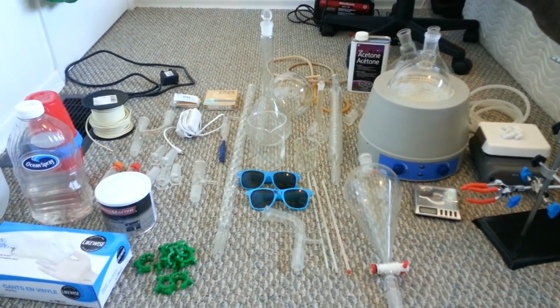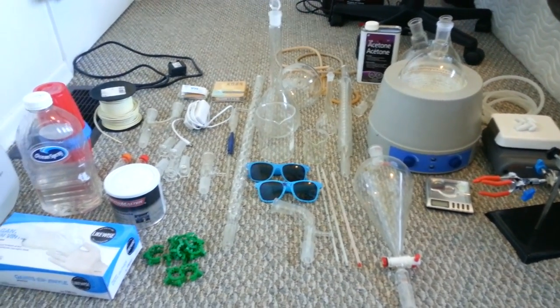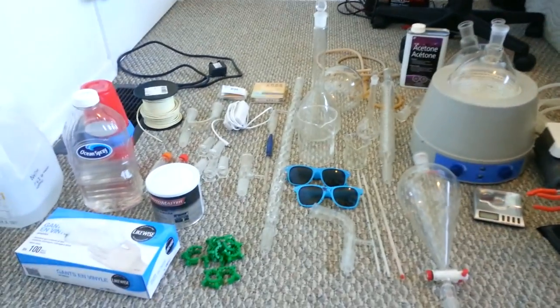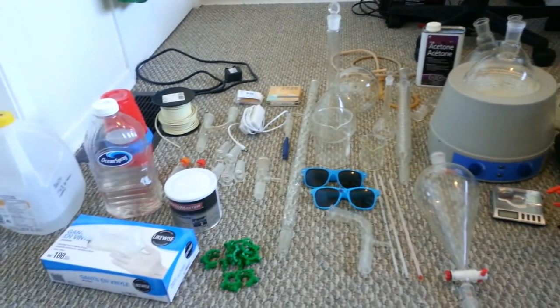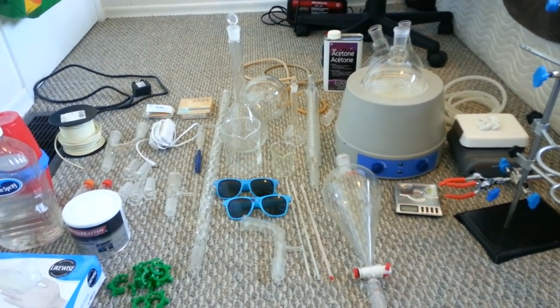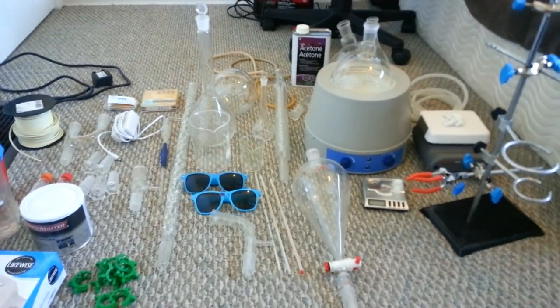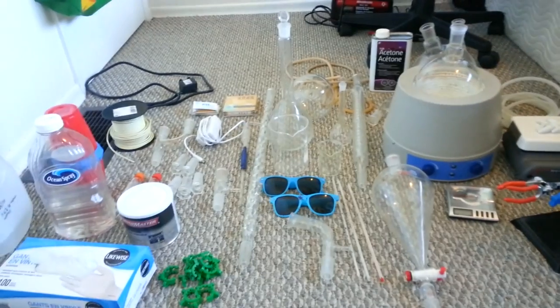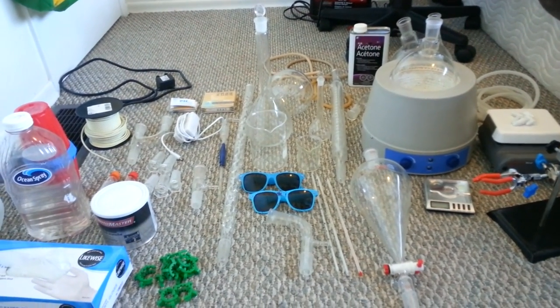So you've decided you want to do some home chemistry and set up your own lab. Let's take a look at some of the stuff that you should get. This is my chemistry set, my little lab going on here. This is pretty much everything you'd need. I have had no problems as of yet with not having stuff. I'm going to go through each item so you can know what they all do.